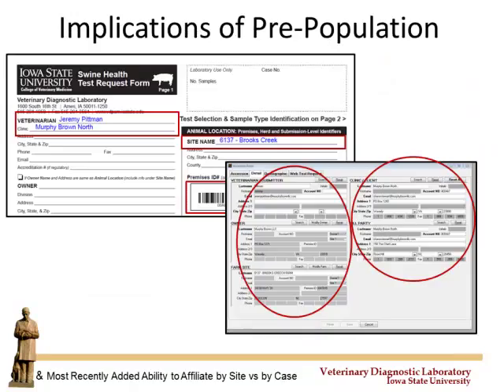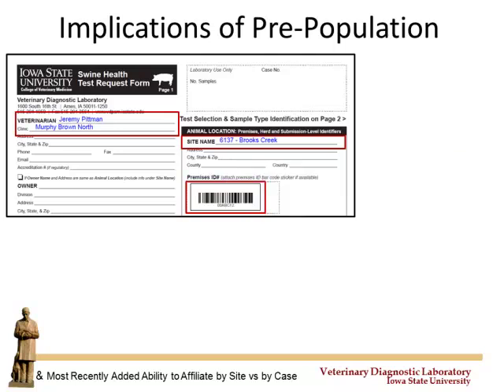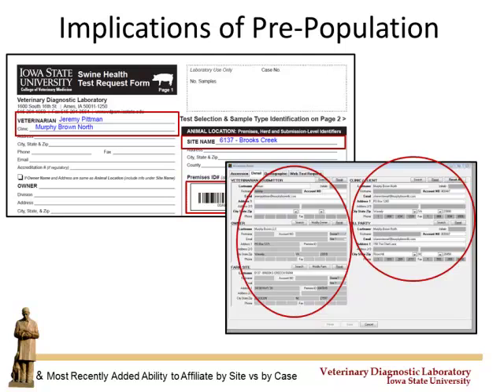And then it just pulls the information all in. Does that make sense? So going back to this whole, how do you reduce chances for error and make it more streamlined and repeatable? And so the Prem ID sticker thing plays into the pre-population things, because then it's just a scan. It self-populates, and we're good to go.